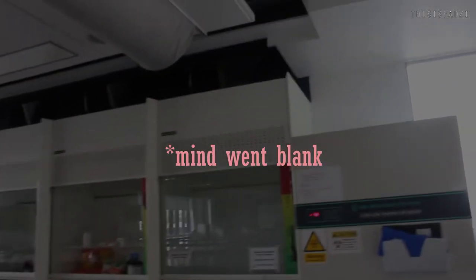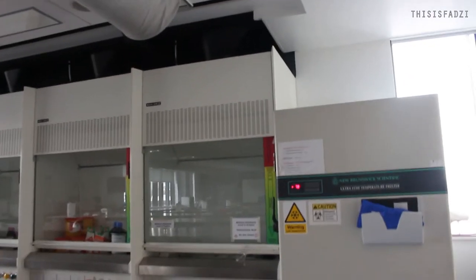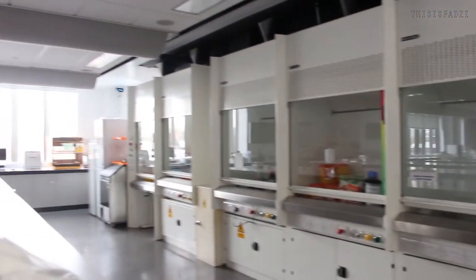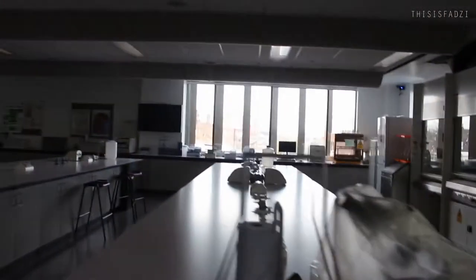What are these? What are these called? These are the fume cupboards. I'm in the lab now, guys.